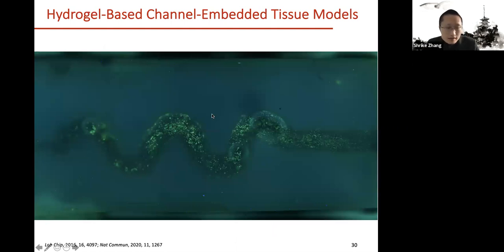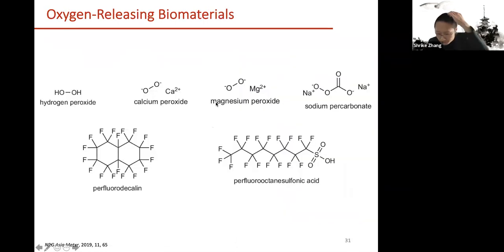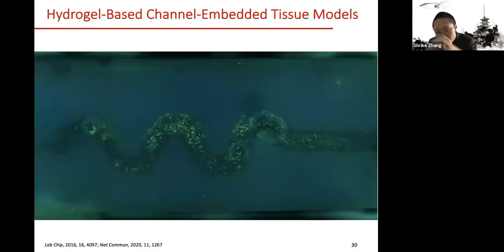these are basically vessels that we talk about, right? So vascularization and all the things. But what about other things? Actually going back a little bit. So these are vessels that I mentioned you can perfuse. So basically you can maintain the viability and functions of the surrounding cells by perfusing these vessels to supply oxygen and nutrients. So with that in mind, when we ask, what if you don't have the complex or sophisticated instrumentation for perfusion or those kind of long-term cultures, right?